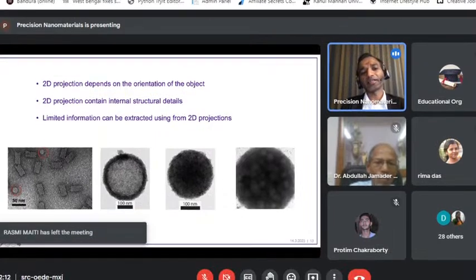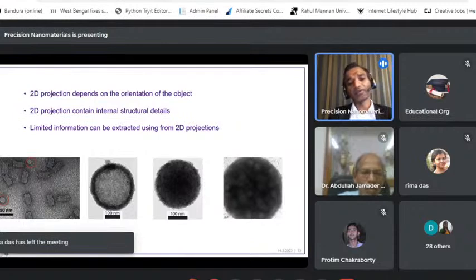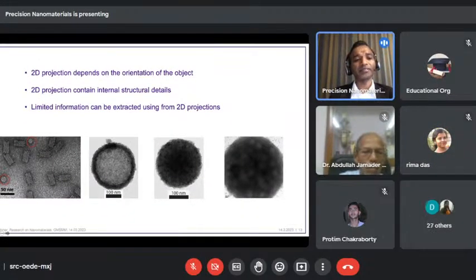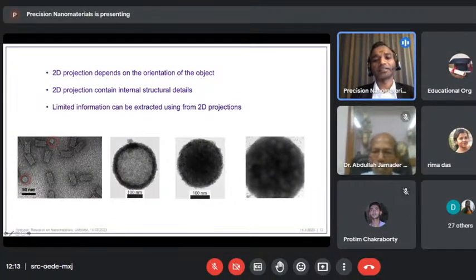Let's say here is an example on the left side with the red circle that I have shown. These are DNA origami and designer DNA structures. They have a rectangular structure, but here you can see some outliers. But they are the same structure, they are standing upright. Then we have a different kind of structure. Here, cylindrical structures, they are different in their shell and the core. In one case, the core is light, it has high contrast to the shell, a uniform core and shell, and you see some pattern. Now, how to understand what these structures really are?